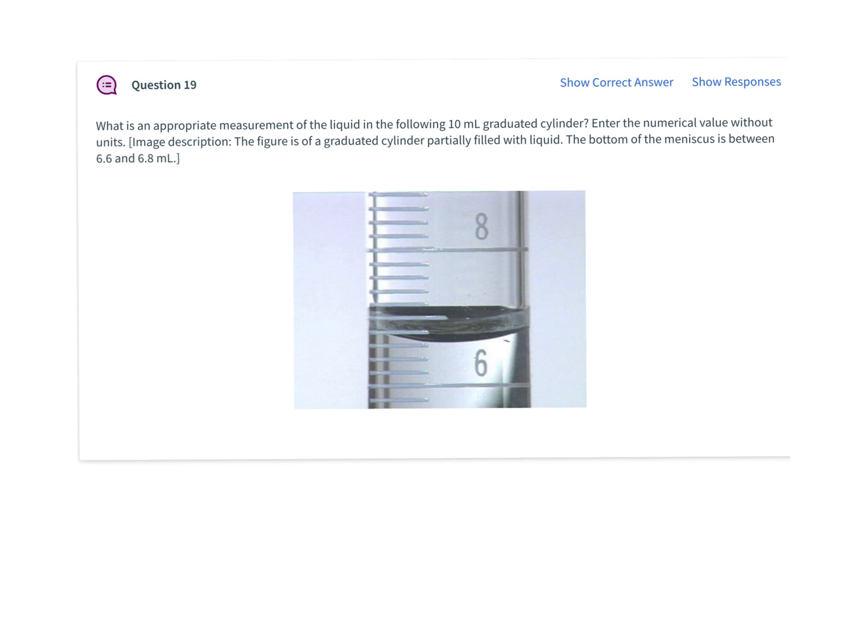Had a few email questions about question 19 from the reading. Please refresh the page before you get started and make sure it says 6.6 to 6.8 milliliters. And the question asks, what's the volume of this graduated cylinder? And that's the key, that you realize that 6.6 to 6.8.